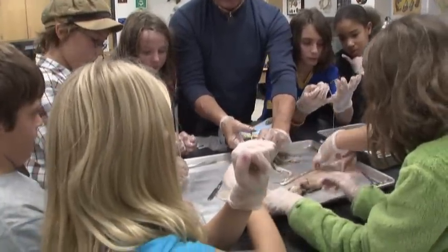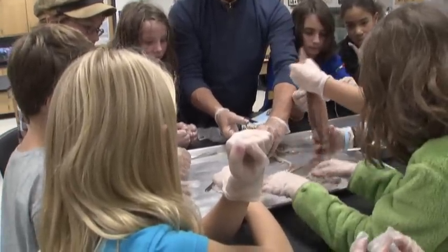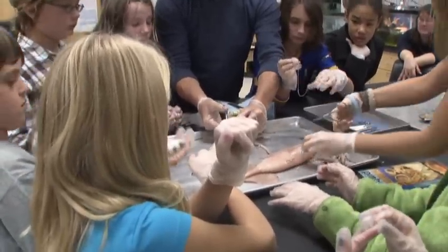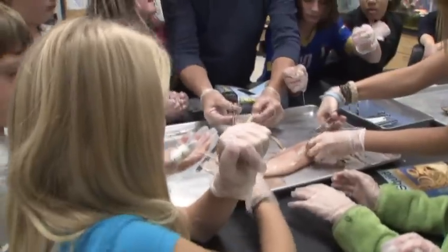All right, now you're gonna guess if this is the boy. We're gonna find out. I think it's the female. Yeah, the female. Okay, Courtney, you're gonna cut yours open. You have a 50-50 chance. I think that one's gonna be the female.